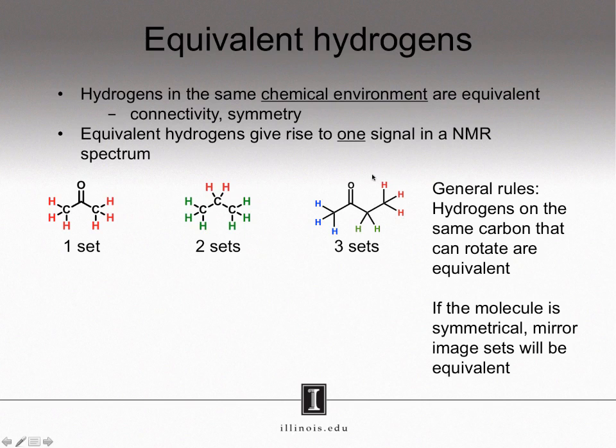The reason for this is there is no symmetry in this molecule. This methyl group is attached to the carbonyl. This methyl group is attached to this methylene. Therefore, the red protons are not the same as the blue protons. Use the same logic in rings.